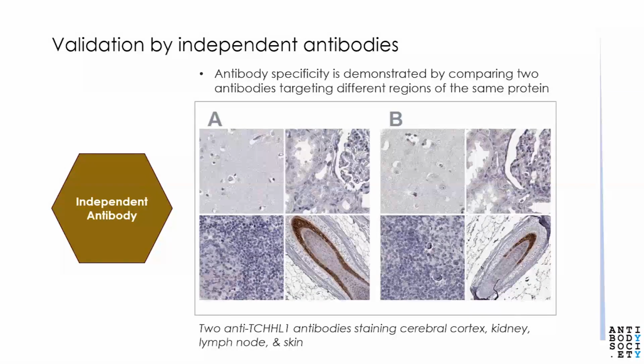And so what that does is validate both of those antibodies as highly specific for the TCHHL1 protein, and it validates the antibody.